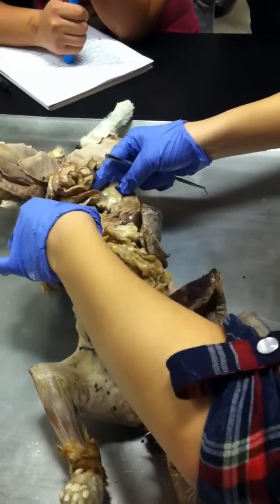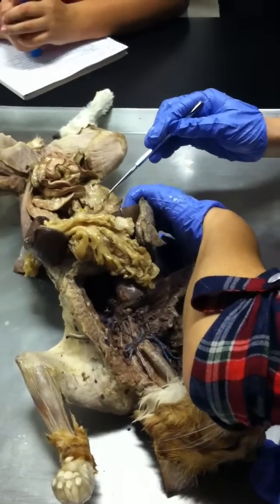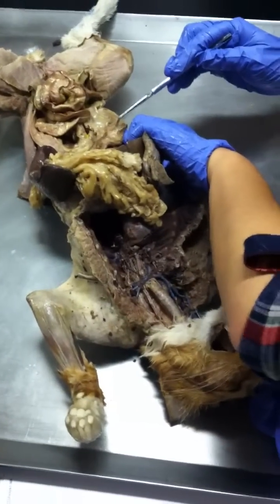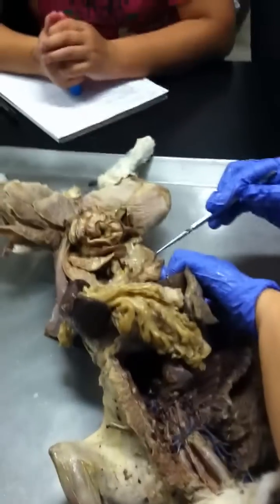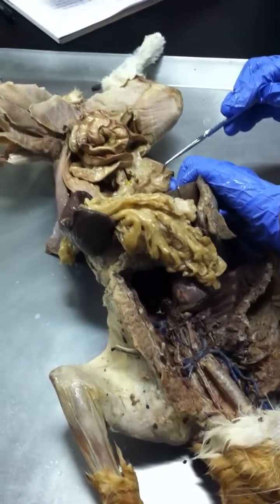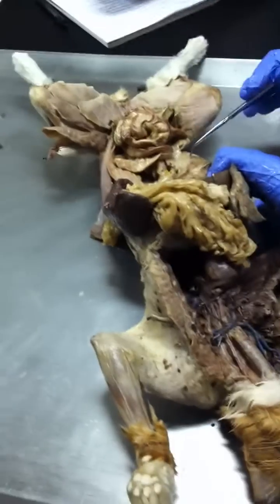You can see the rainbow? Right? If I pin this structure, and I ask you, okay, this structure, is it part of the midgut, foregut, or hindgut? Is it part of the hindgut? Midgut. Why? What is the structure? Ascending. This is the ascending colon. Remember, jump is a trap, right? Ascending colon. Okay. A trap.